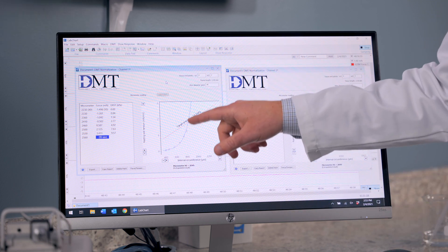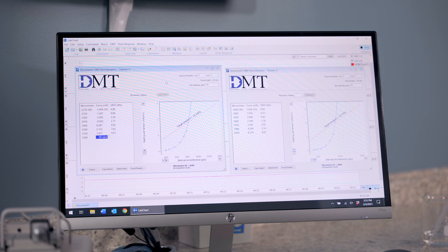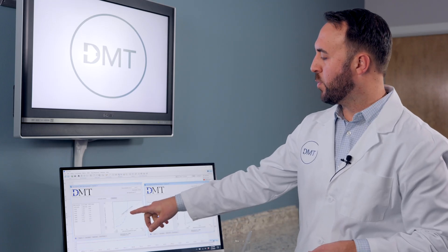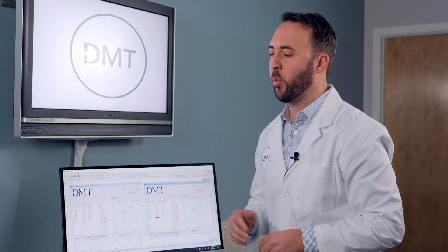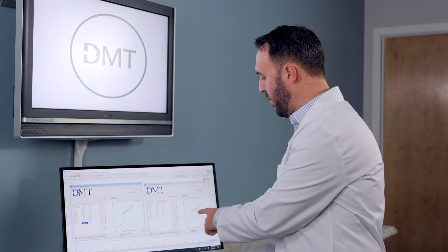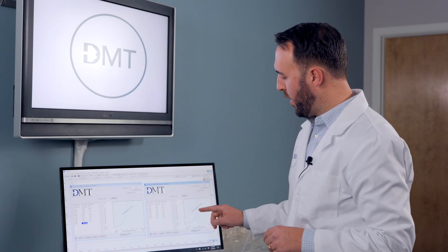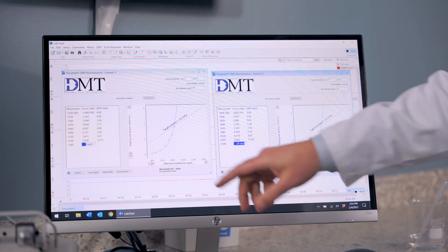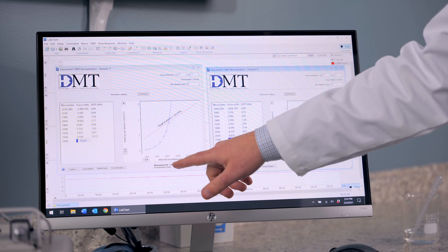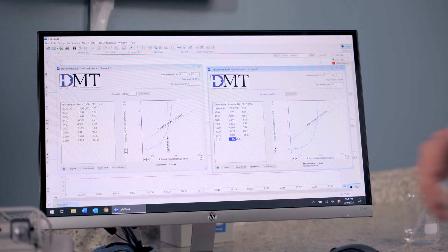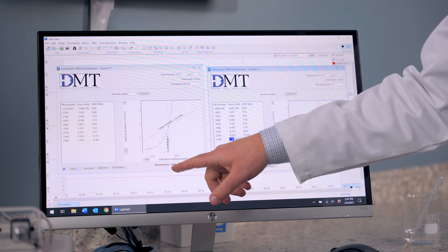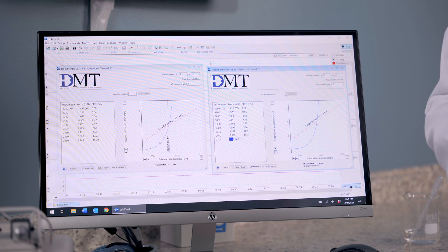Remember, this is a best fit curve, so not all of your points are going to be right on the line. This one is very close but still under the line, so we will do one more reading to get above it. You will notice that while you're still below this line, you will see an extrapolated result under the best ideal micrometer setting. Once you have passed that line, as we have now, it no longer says extrapolated result, and it now tells you the point at which you should set your micrometer.